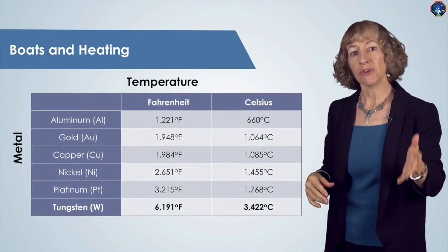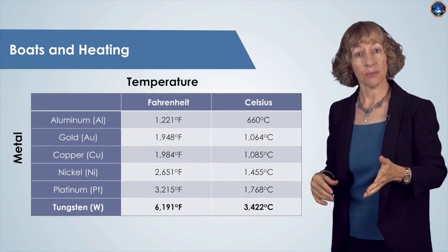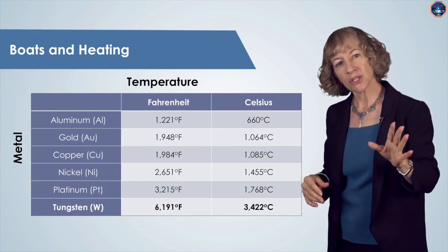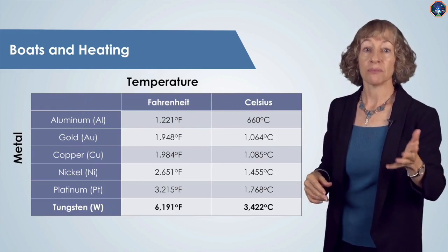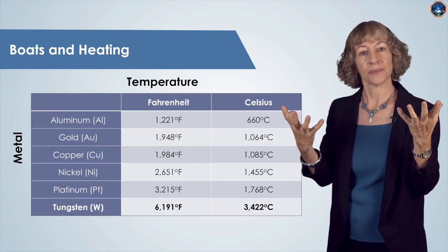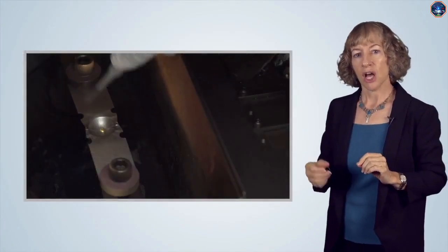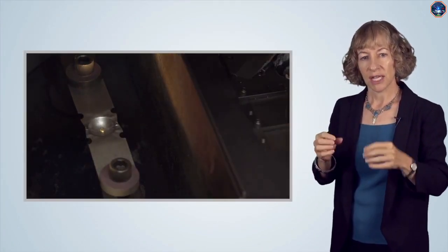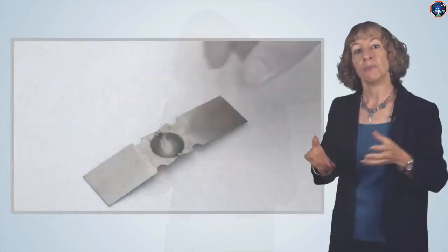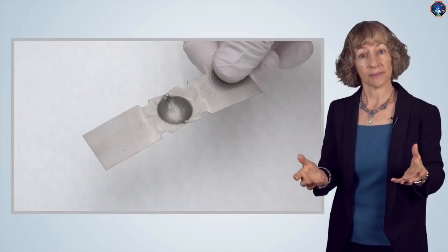Metals and dielectrics can both be deposited using this vacuum thermal evaporation technique. But thermal evaporation is typically used most for metals, since metals melt at pretty low temperatures and produce very steady deposition rates. To conduct a thermal evaporation, a small amount of our source material is placed into a container called a boat. The boat is heated by passing a large electrical current through it to heat it up in a process called resistive heating. The boats that we use are typically tungsten.